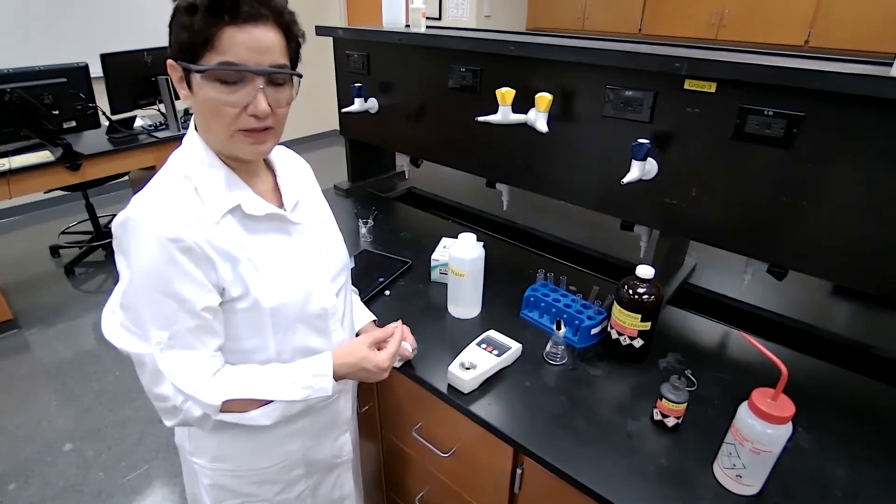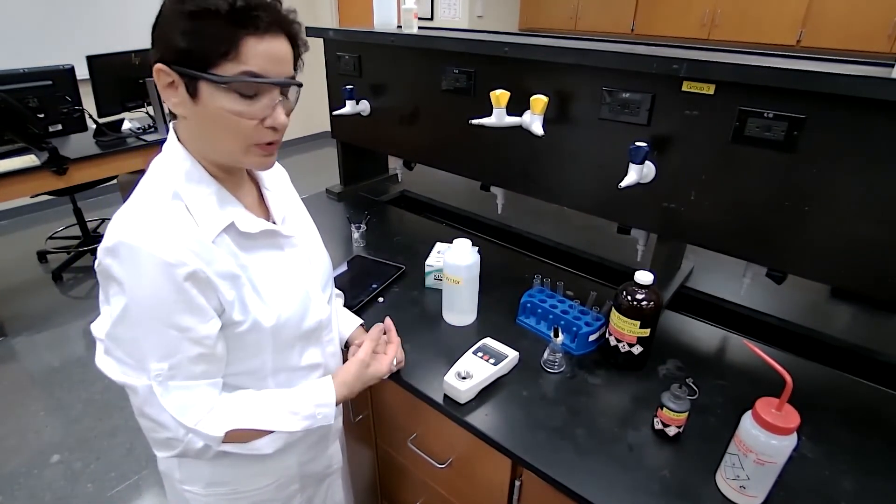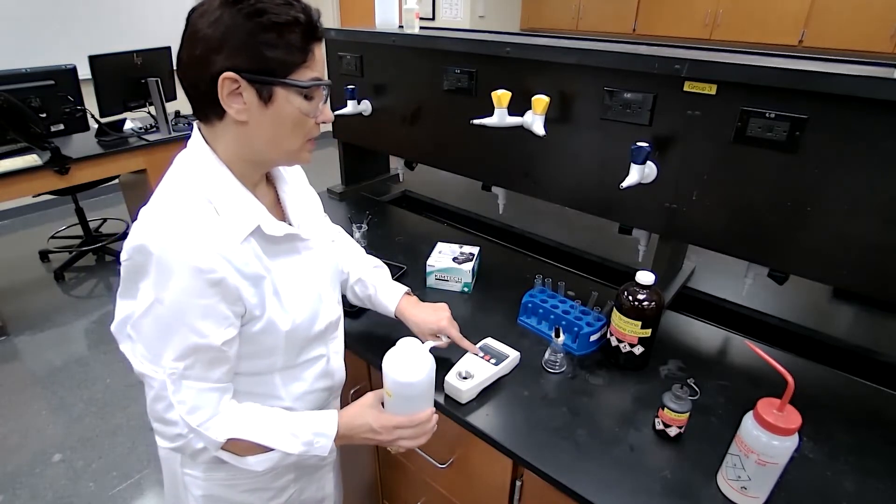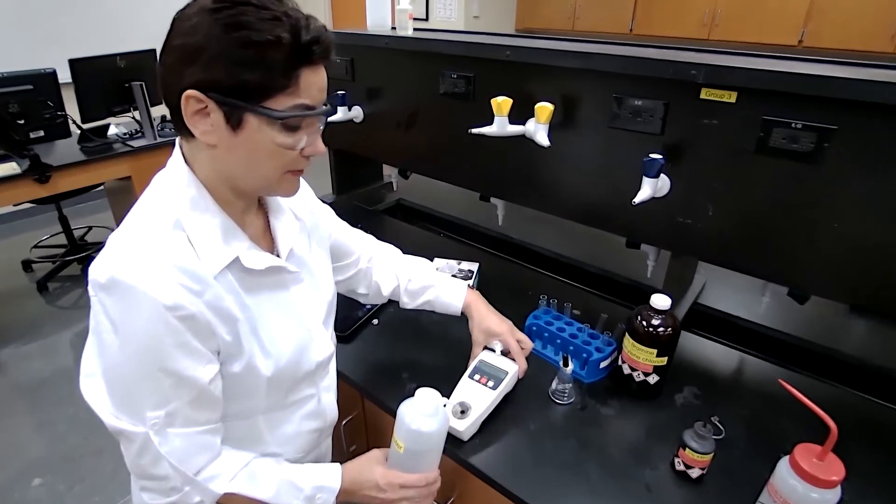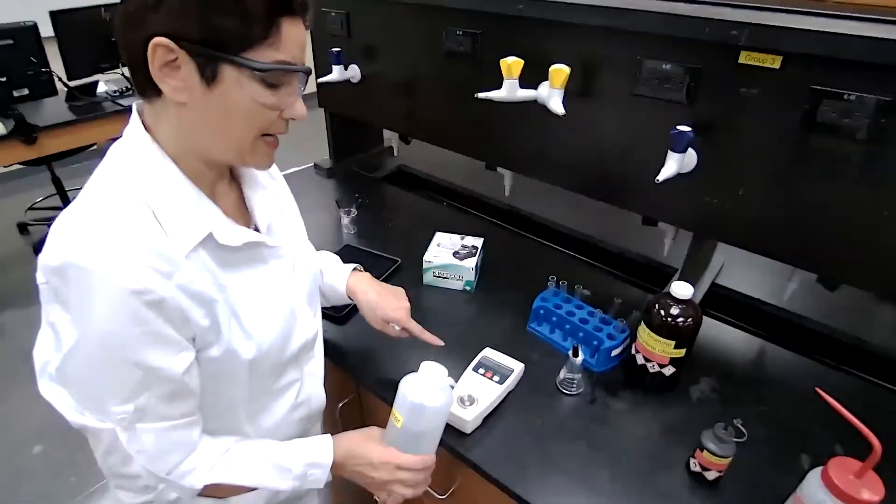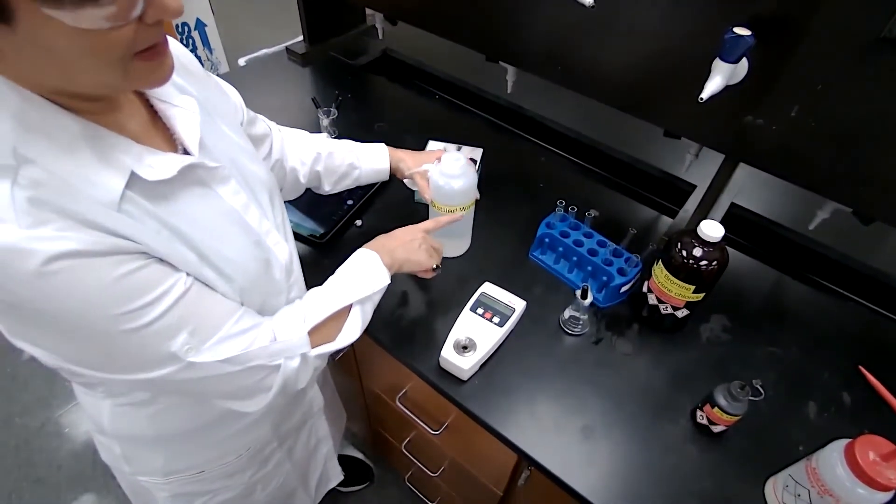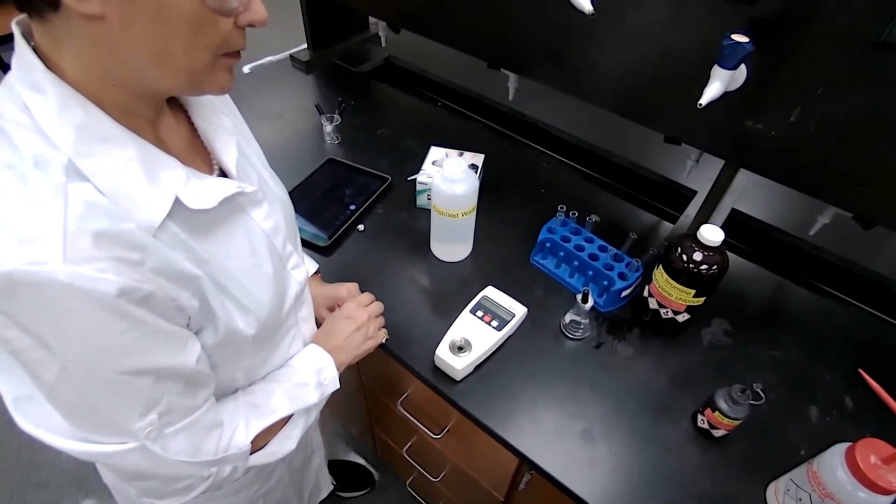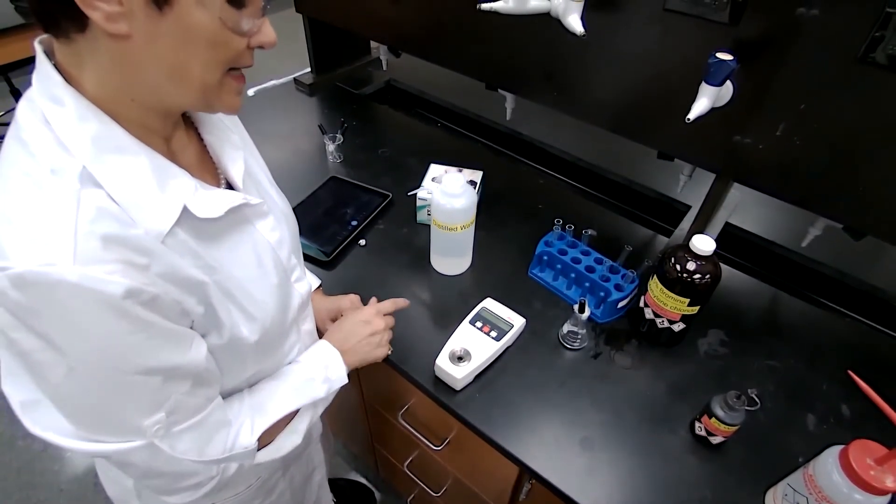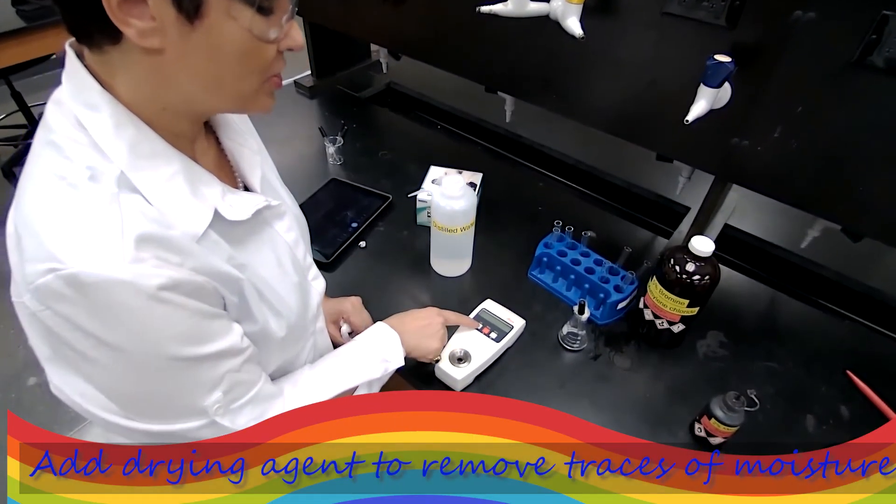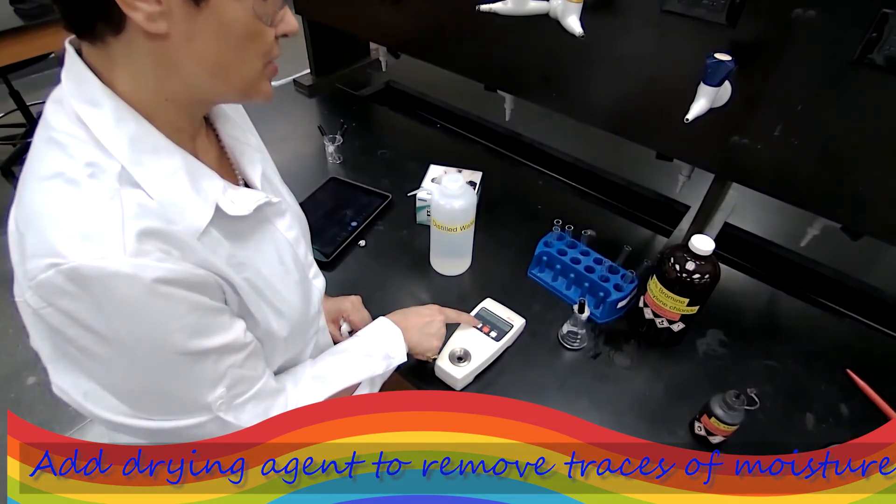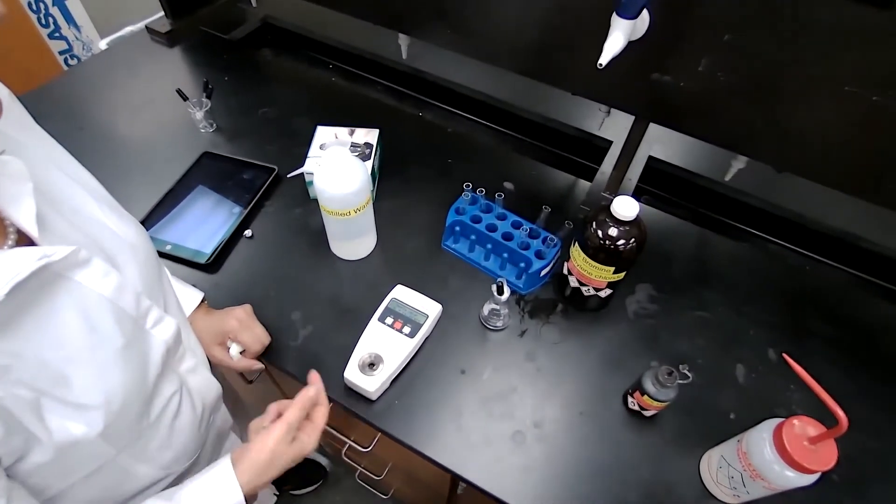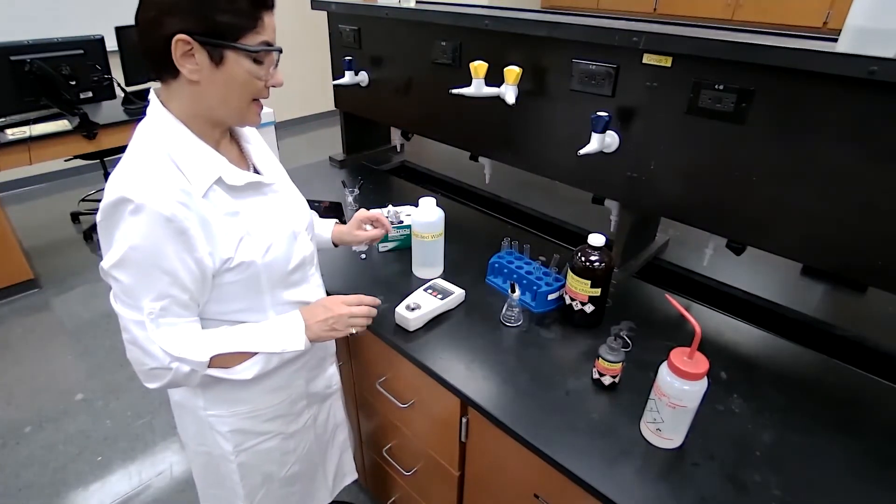The last test, which is called a physical property compared to the other two that were chemical tests, is measuring the refractive index of the product. First we need to calibrate our refractometer. This is a digital refractometer. When we press cal, it's asking to add distilled water. We add the distilled water. It's going to read the distilled water as a standard. As soon as it gives us the okay, that calibration has been complete, calibration success.